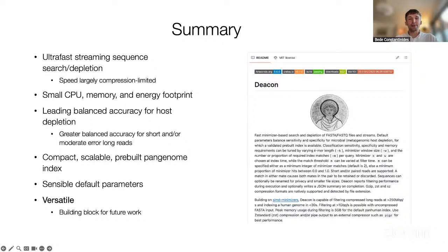So sequence databases are getting larger, sequences are getting faster. We know that the forthcoming Roche sequencer will generate data incredibly quickly compared to existing platforms. And so, more generally, we need fast, efficient, sufficiently accurate methods for whittling down big data sets into the things we're interested in. And Deacon is equally useful for searching a gene in a huge data set as it is for host depletion.